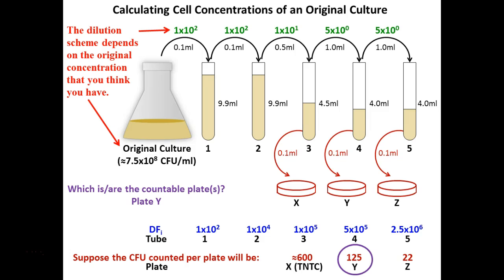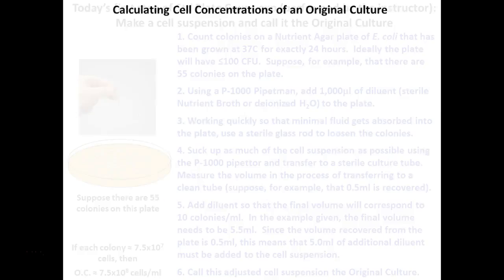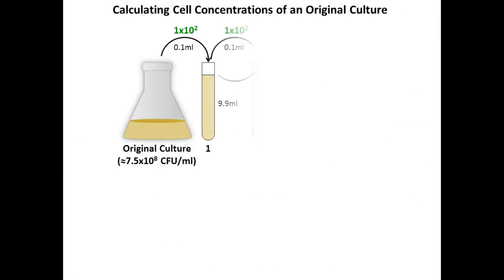For this dilution scheme, I'm going to back it up, or it shows the answers. See if you can, on that single worksheet that I have for you today, calculate individual tube dilutions and the dilution factor. And then I'm going to give you, remember I said add W, because it's actually my plate 2 that ended up being countable. My plate 2 was 69 colonies. I'm going to show you those plates in a second. So I'm going to go ahead and stop my recording for now.